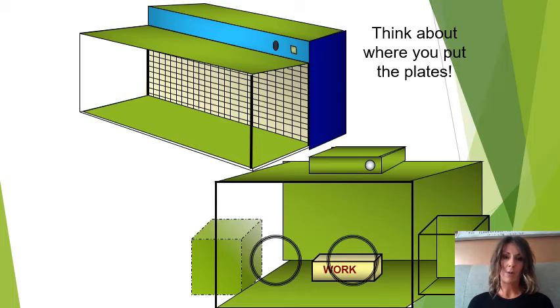Here's a diagram of a laminar flow and an isolator cabinet. In our laminar flow, we have a plate here in the back corner. Our air flows from the grill at the back, so our cleanest area is at the back moving forward. Why wouldn't we want it there? Does that really represent our work zone? It doesn't. It's sat right next to the filter. It's got lovely clean air flowing over it, and it's not really near where we are going to be completing the production process.